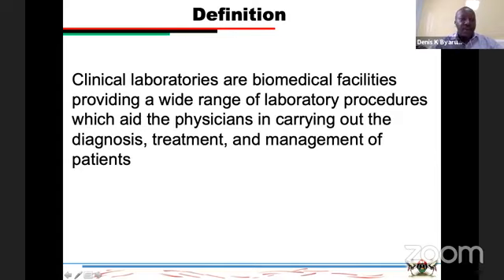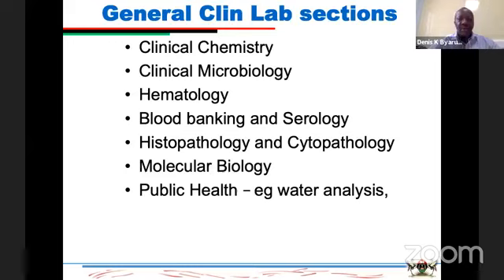So just as a background, you are all familiar with what clinical laboratories are, where they are offering a different range of laboratory procedures to aid basically physicians in management of patients. And these might come in different ranges, but we'll be focusing particularly on the molecular biology testing, which encompasses the PCR tests that are being currently run to inform treatment and management of COVID patients. But otherwise, there are different kinds of sections that you might find in a clinical lab, including clinical chemistry, clinical microbiology, hematology, blood banking and serology, histopathology, and molecular biology or public health.